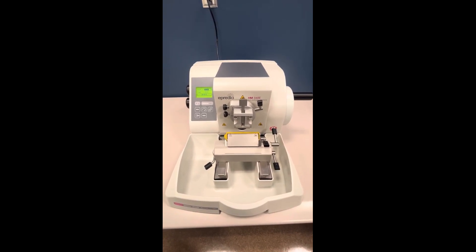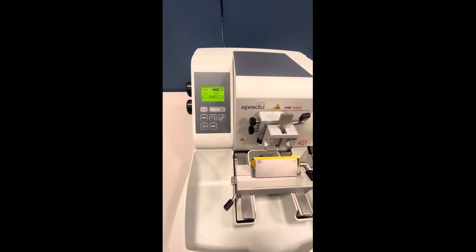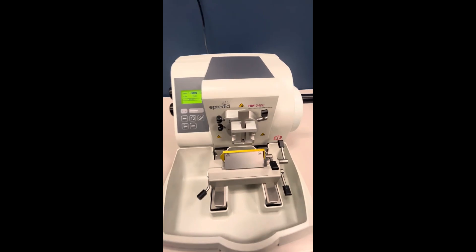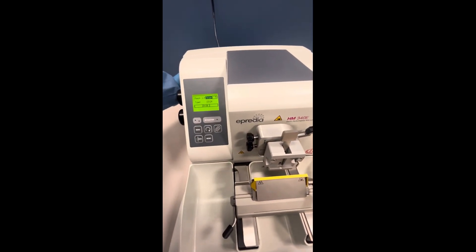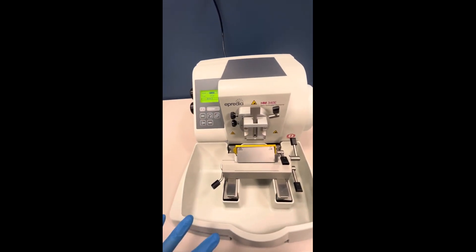As you can see, this microtome is already on. However, the power button is here on the back side of the microtome, and this is the front side of the microtome.